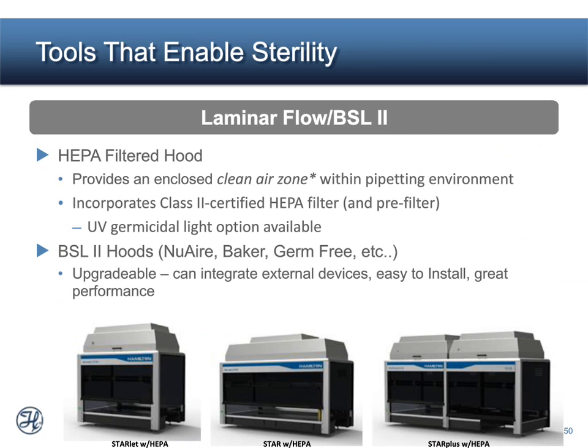Again, as I mentioned earlier, sterility is one of the biggest things to consider. Liquid handling platforms, you can put HEPA filter heads directly on top of the liquid handling platform to allow for a clean air zone and a contamination-free work zone. These are nicely seamlessly integrated.